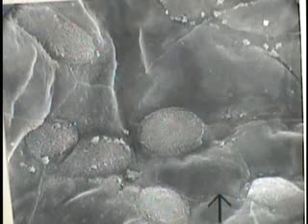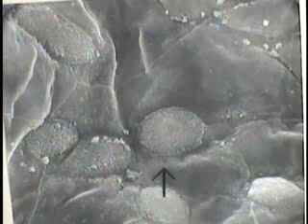Another boundary is shown here, that little raised line. So those are the junctional complexes that bind type 1 cells together as seen along the surface. Another is shown coursing this way.